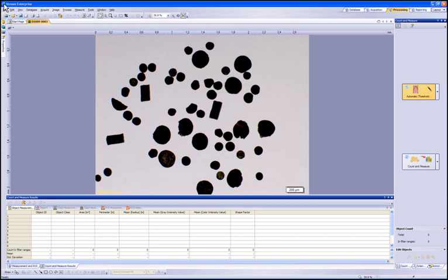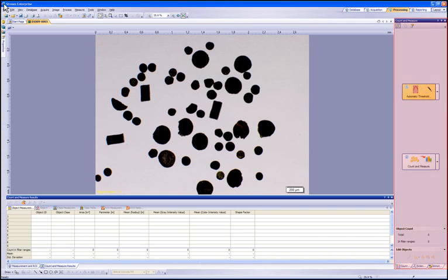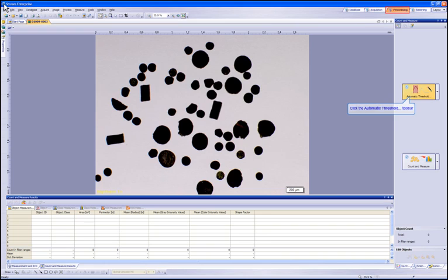Once you have your image captured with the particles to be counted clearly defined, you will need to interface with the count and measure tool window within the processing layout. First, you will need to set up the threshold for your image.